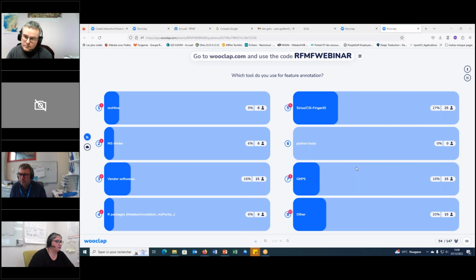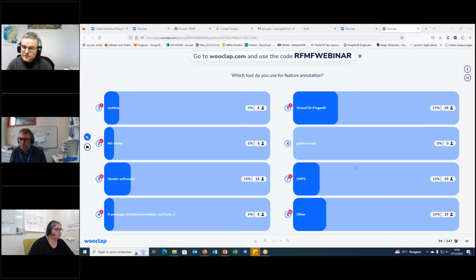So that's why the tools for annotations now contain some QA/QC verifications. And we can also use the data independent analysis and use other software for the deconvolutions. But again, we need many points to have a nice deconvolution and nice MSMS spectra.